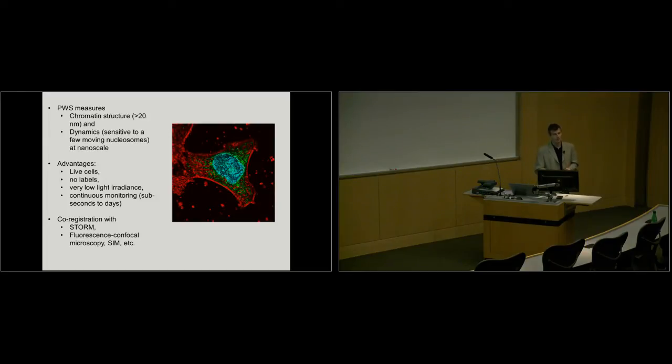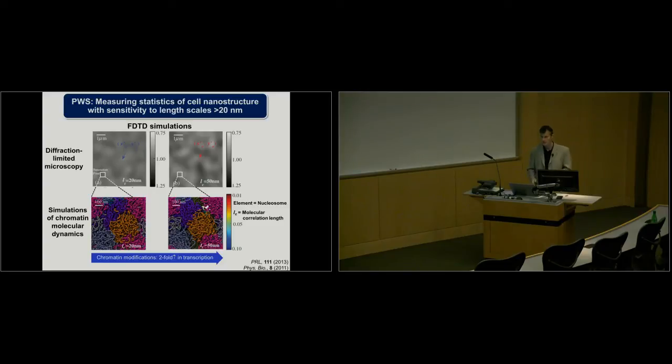And with this technique, you can study live cells for days, basically, on end without damaging them. And it was co-registered with a number of other techniques. Let me give you a sense what this sensing actually is. This is one example. This is actually simulations.